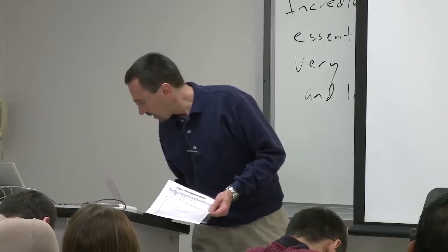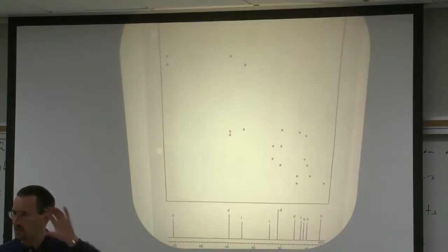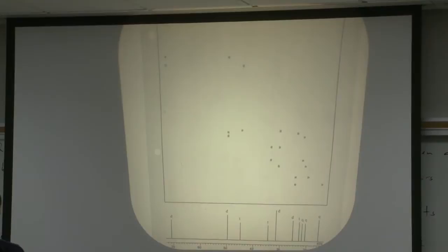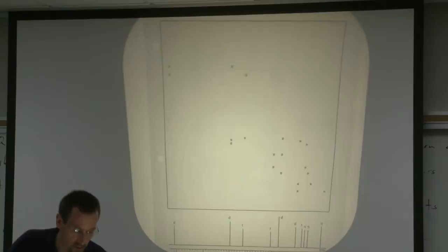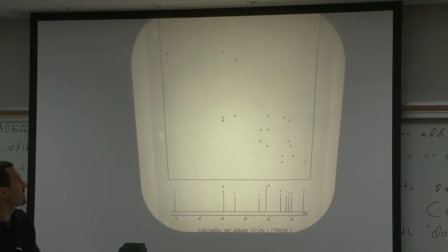A lot of the examples and handouts I've been giving you are from a book by Koji Nakanishi, who's a natural products chemist, and basically he put together various nice little 2-page handouts in the book on various spectroscopic, various NMR techniques. They were recorded on a 400 megahertz machine, so this is recorded on a 100 megahertz carbon NMR spectrometer. They're kind of old, so it's nothing near as powerful as what you have downstairs with the cryoprobe.